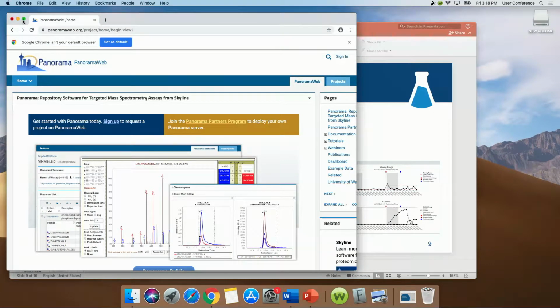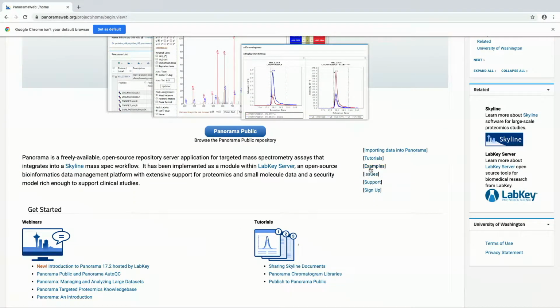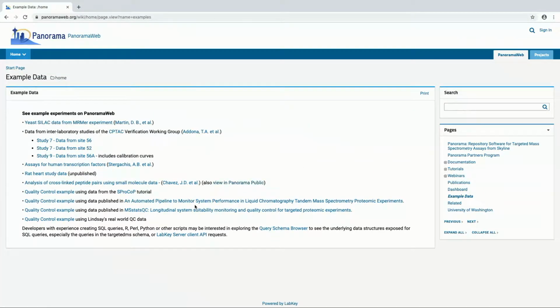Pretty much all of these basic tools are going to be available in that QC trend report, the premium feature that you can feed whatever your data source into. But this is a convenient example because it's already public. You just browse there without an account and see what it's all about. So you can see we've got a number of different QC examples here in our list.